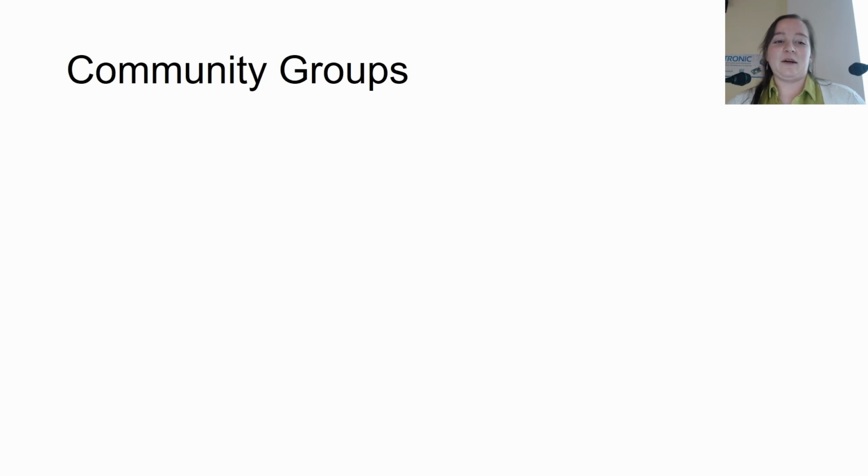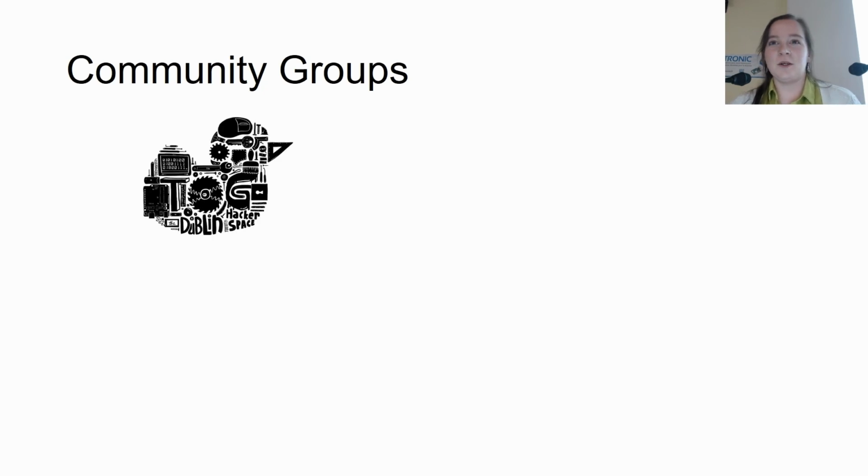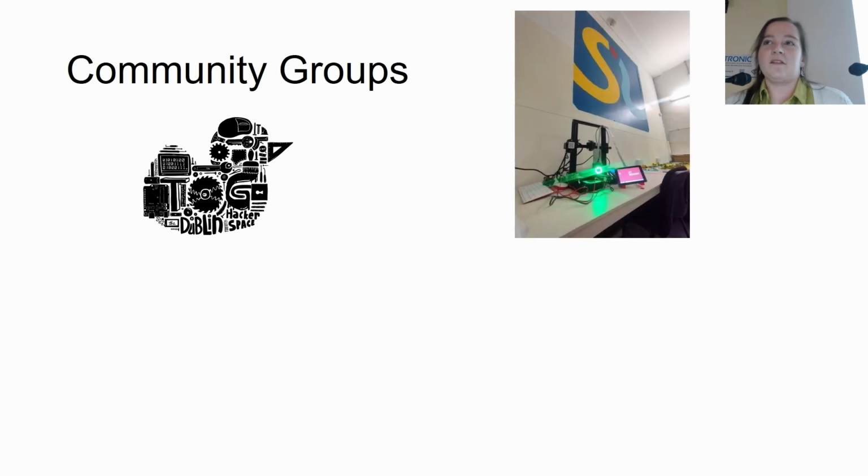And then for community groups, we've shared an EnderScope with a makerspace called TOG in Dublin, and with a Scouts group. So this is in Leixlip, which is a place where I'm originally from. And this Scouts group, it's mostly made up of children and teenagers. They want to use the EnderScope to look at the water quality of the nearby river that's near the scout den.